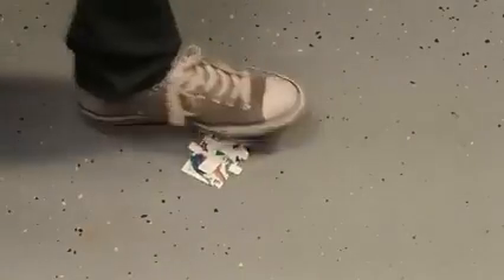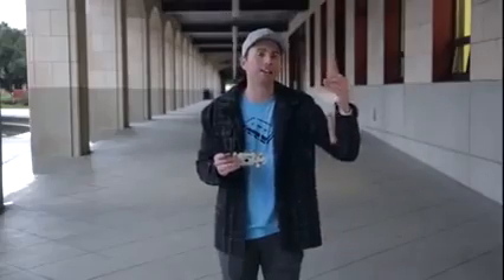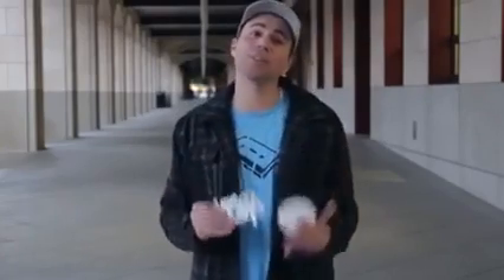I'm holding in my hand a microscope that is waterproof, stomp-proof. I put it together in two minutes and it costs 50 cents to make. And in this hand, I have a blood centrifuge that spins 10 times faster than a $10,000 centrifuge and it costs 18 cents. Both of these were invented here at Stanford in the lab of a brilliant physicist, biologist, inventor named Manuprakash, with the goal to help improve the life of the world's poor through low-cost, effective, scalable inventions.